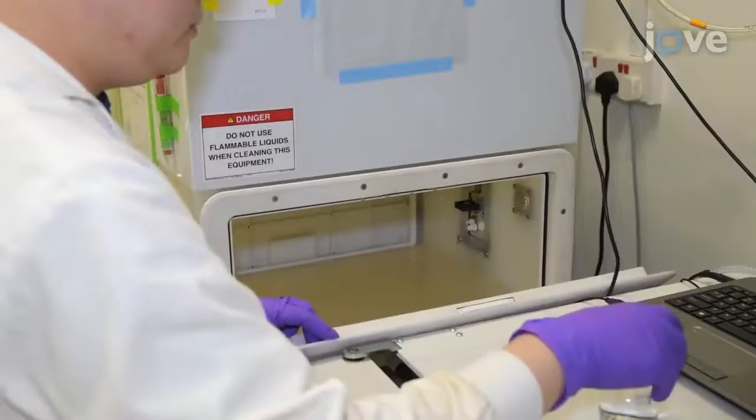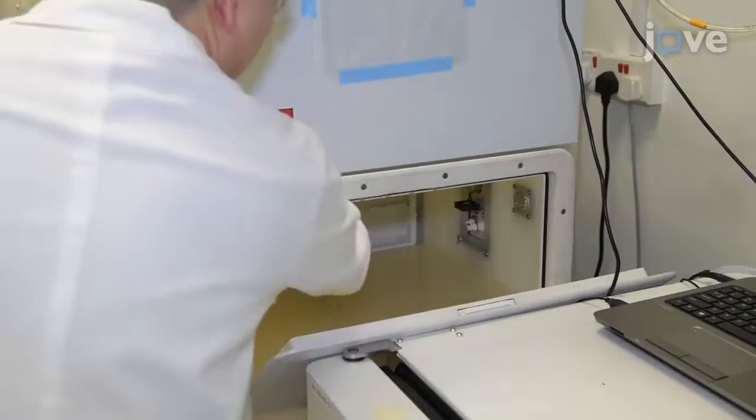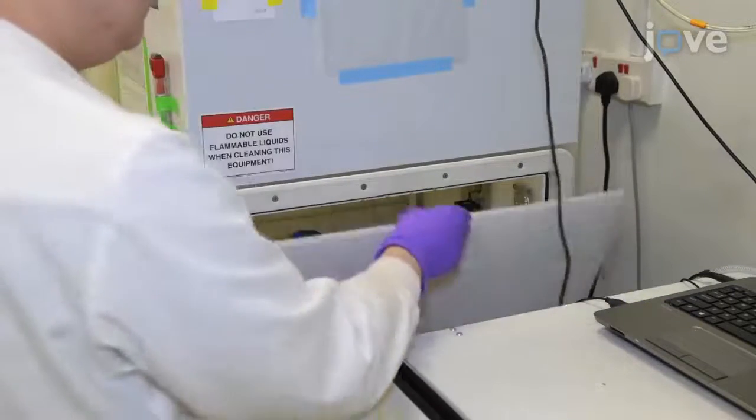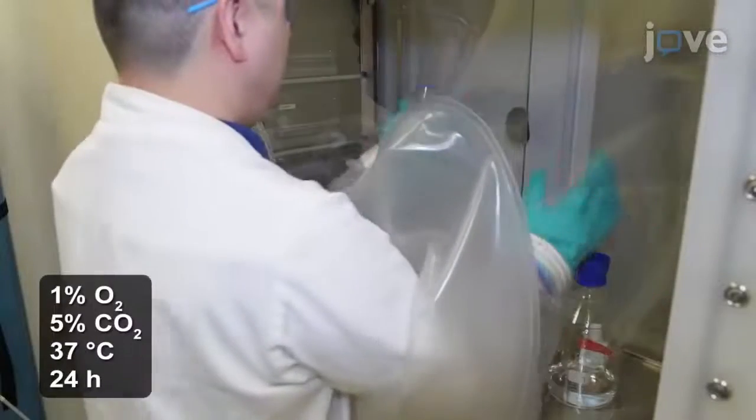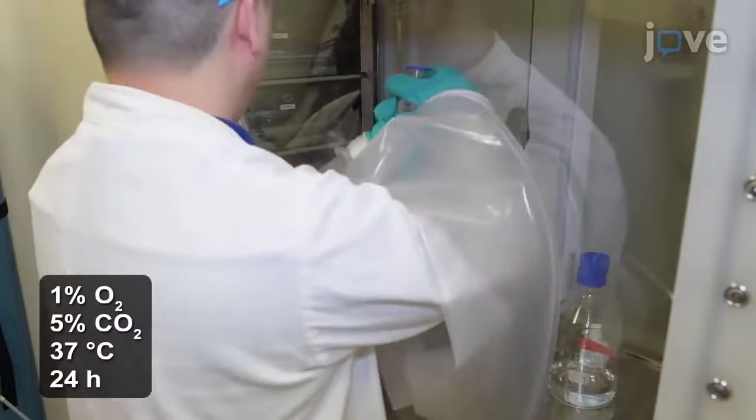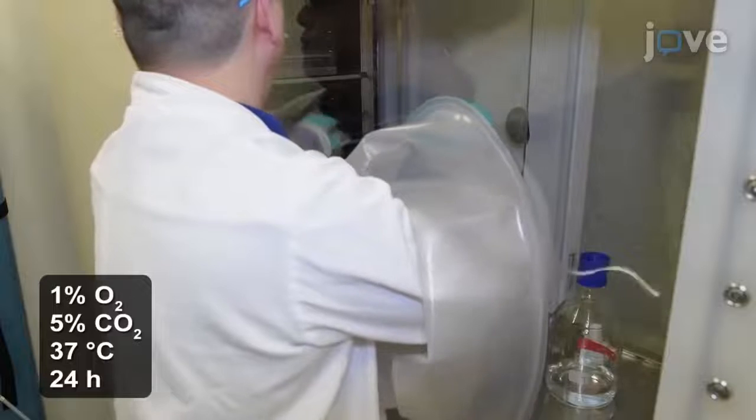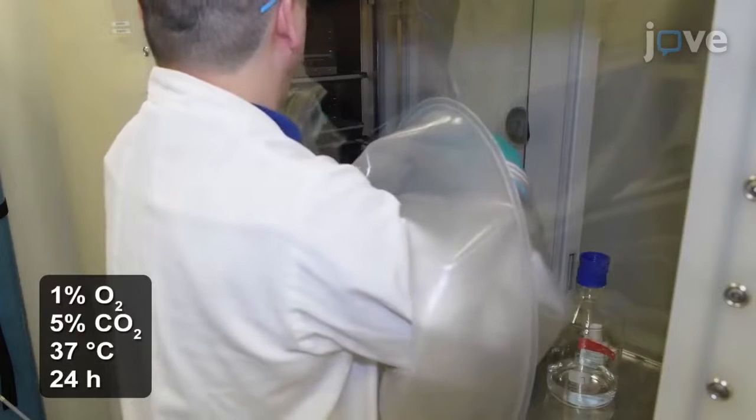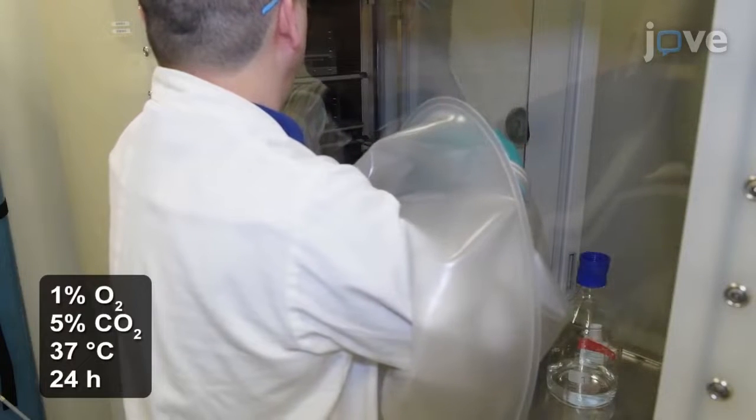On the day before harvesting the hypoxia-treated cells, pre-equilibrate DPBS to hypoxic conditions by placing an uncovered 100-milliliter glass reagent bottle filled with DPBS in the hypoxia subchamber for 24 hours.